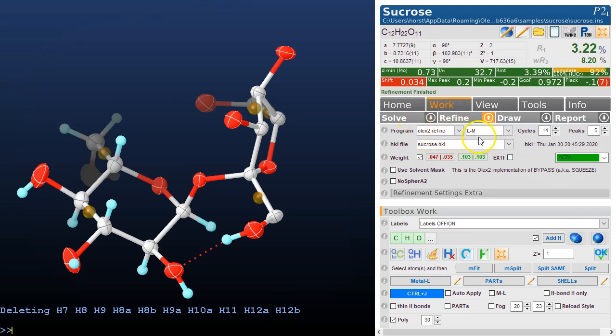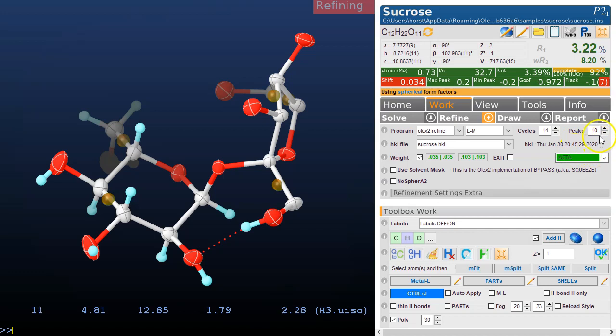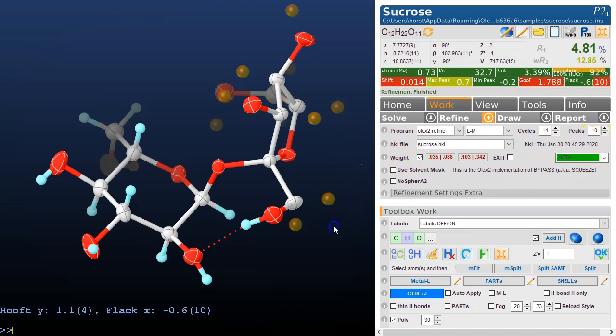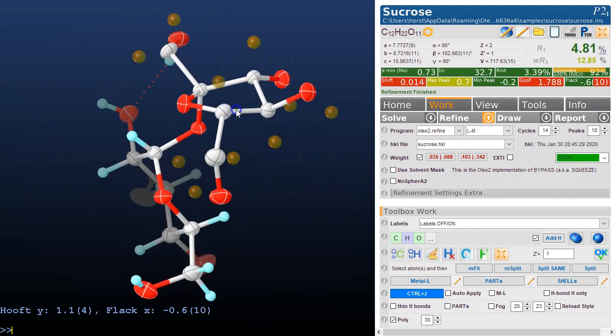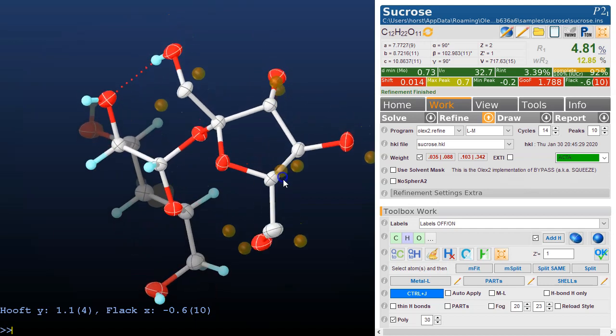If I refine this, then Olex2 automatically increased that to 10 peaks because it figured out that there's probably 10 hydrogens missing. If you look at this, it's fairly clear that these have all been found, so Olex2 doesn't show you too many peaks that you might not want.